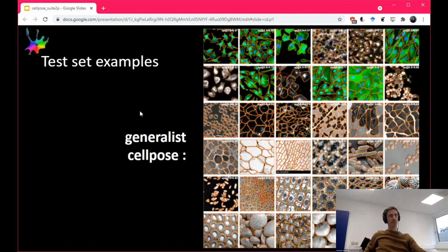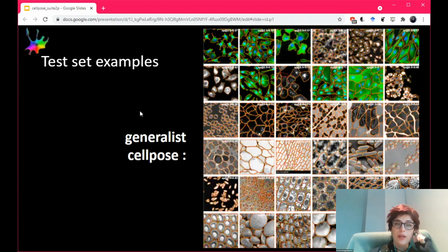But you don't do anything special there, or is it just a two-color image? Yeah, you're absolutely right. We don't do anything special, and for these images we don't have the nuclear segmentation, so we can't actually train it to simultaneously do the segmentation for both. We're just using it to facilitate the segmentation of the cytoplasm.